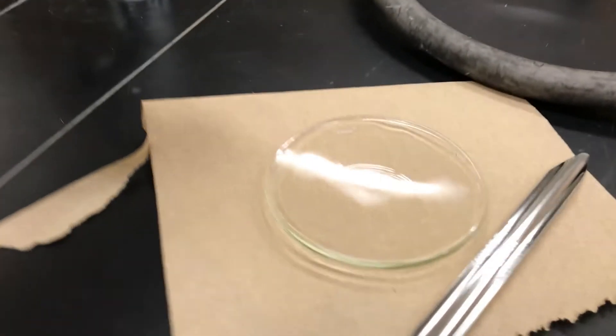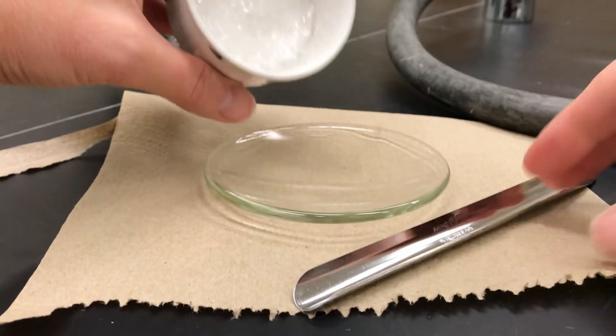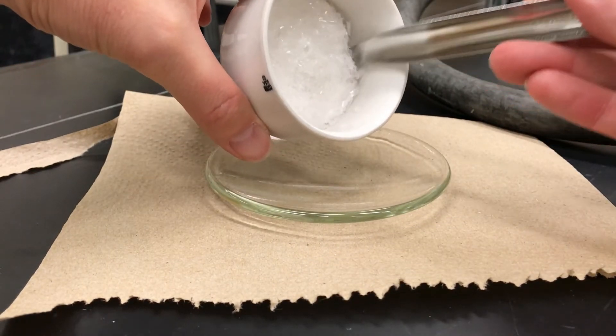So to collect it, scrape the solid onto a pre-weighed watch glass. Use a spatula and you may as well scrape off the entire thing, including the filter paper.